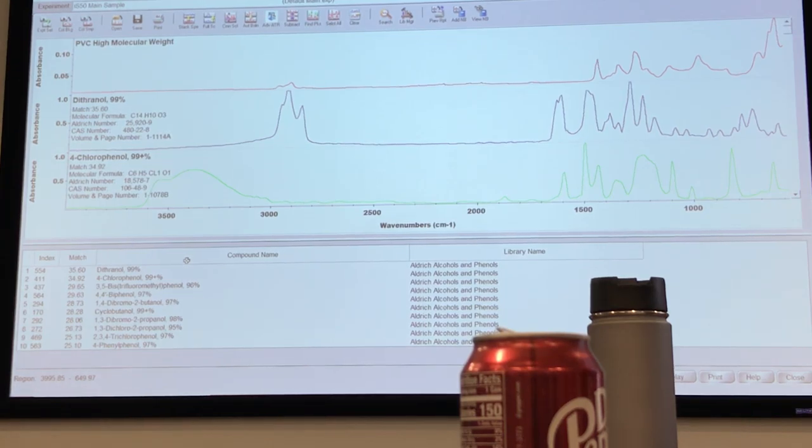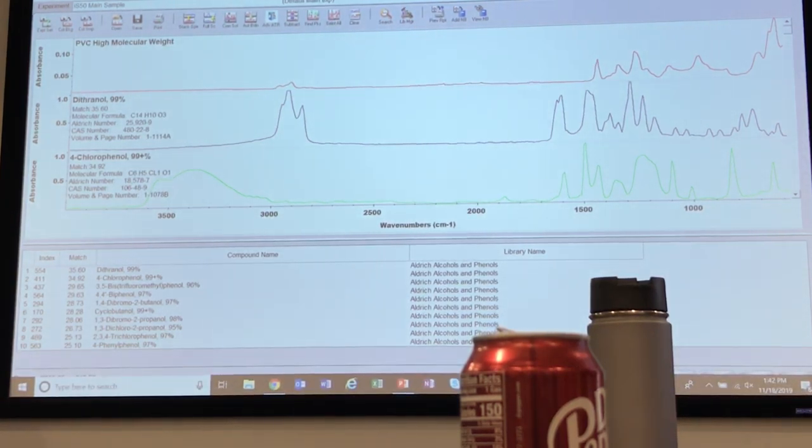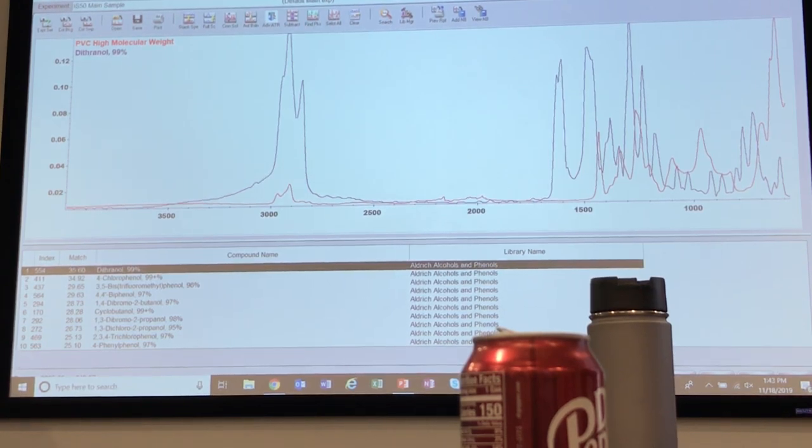the spectrum is going to look different, right? So that's why it is really important you overlay it and make sure that it is the right thing or not. Just make sure at least some of the peaks are matching, and why something is not matching, and so forth. So we call this our eyeball test.